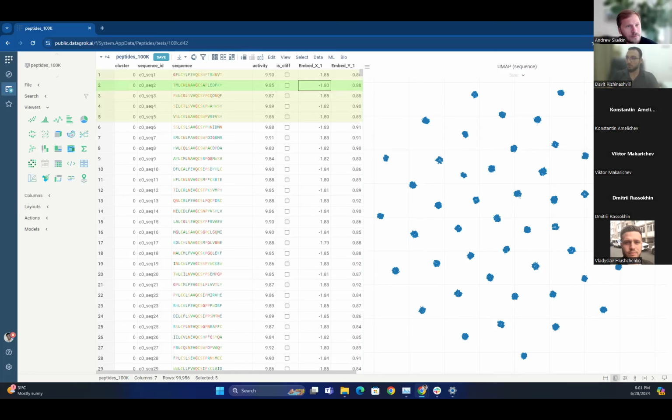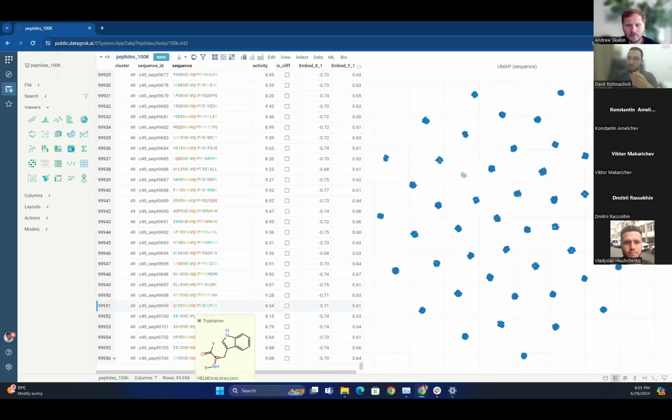As you saw, this is an artificial data set, by the way, with 50 defined clusters, each defined with a specialized motif. You can see that this clusterization indeed resulted in 50 quite distinct clusters. What this then enabled us to do is that all the things that use dimensionality reduction at their core, like sequence space or chem space, which Datagrok users should be familiar with, and also other things like activity cliffs, we were able to rewrite in webGPU as well.